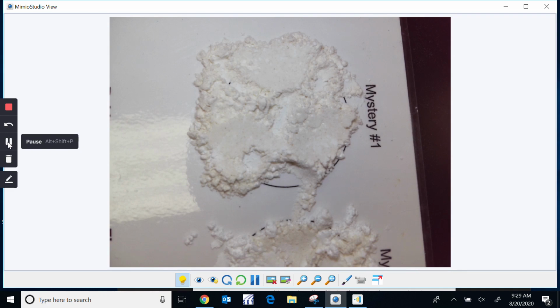Now that you have seen some of the different reactions that happen with each of the individual powders, now we're going to be testing the mystery powder, so you might have to reference the results from each of the individual powders as I do this. So this is mystery powder 1. You're trying to figure out which mystery powder has the 3 powders that are in her cookie recipe. So here is the water test for mystery powder 1.